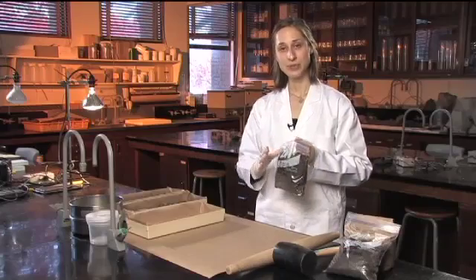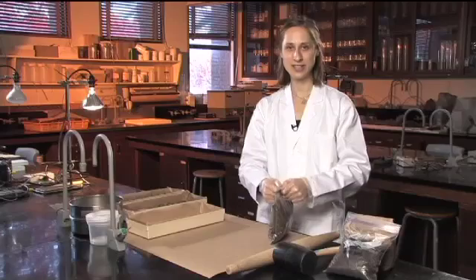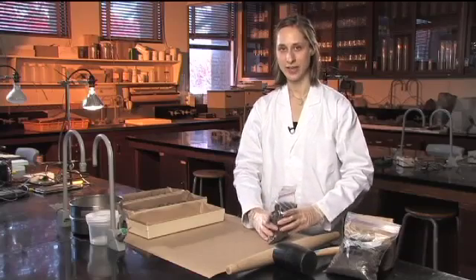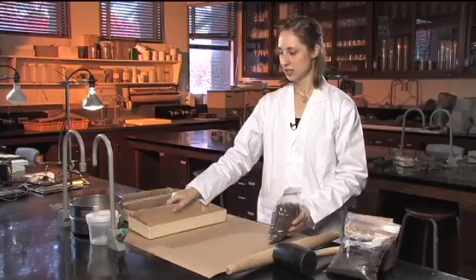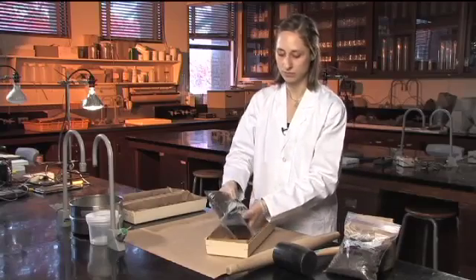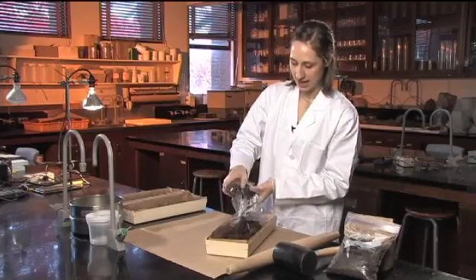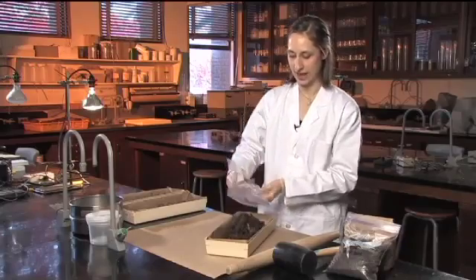Hopefully you've kept your samples either cold or open to the air, and as soon as possible you want to start air drying them to stop any chemical changes. Prepare a clean surface or tray that you can lay out your samples in and just dump out the sample into the tray.